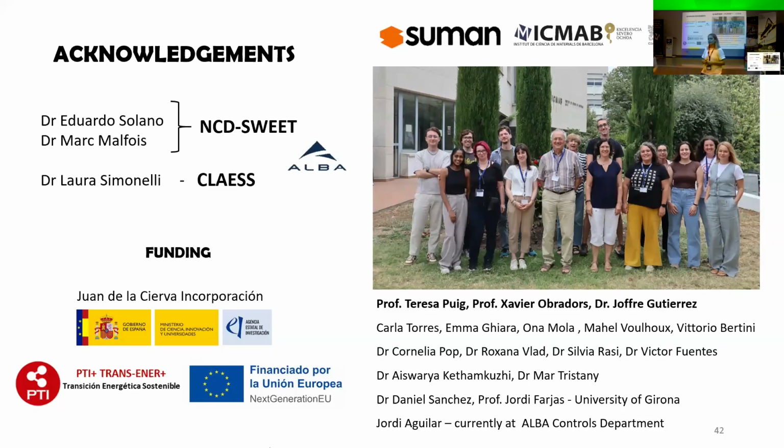That would be one background we can do. And then also in the data analysis, there are some techniques where you can subtract the first frame. For example, for every segment of the TLAG growth, we probably would have to subtract the first frame, before the heating starts, from the following ones. And after the jump, the first frame could also be subtracted to extract the changes. But this is maybe not totally correct, and now we have to think of how to do it correctly. But we have seen the STO blank experiments.